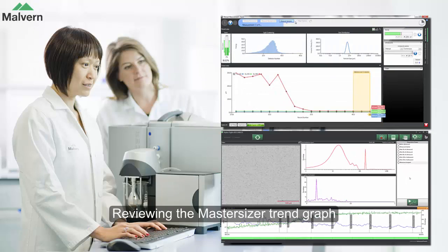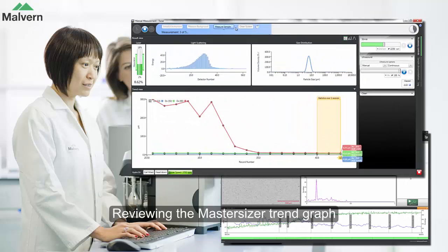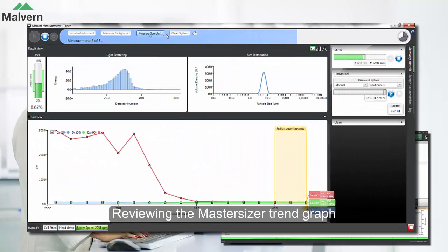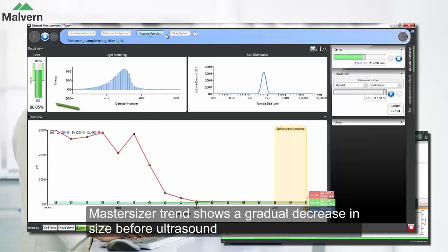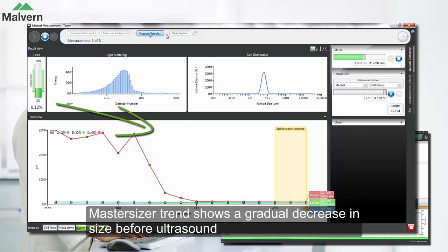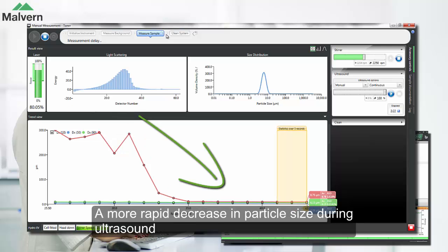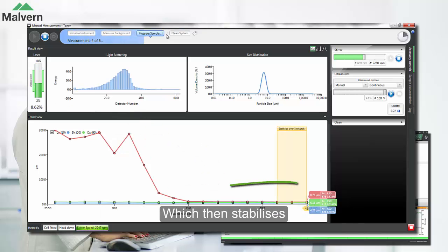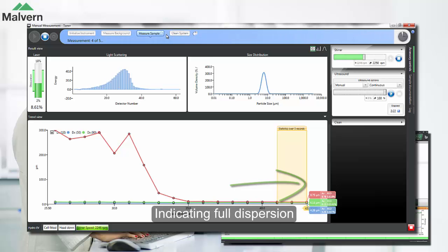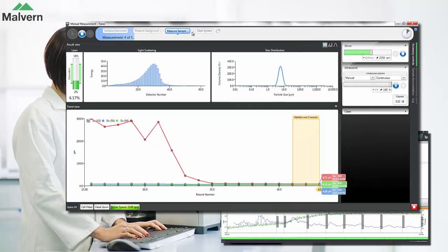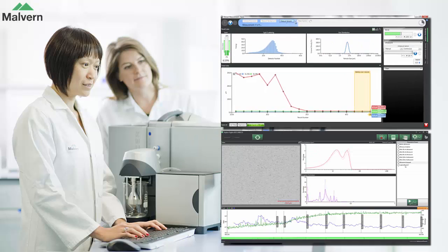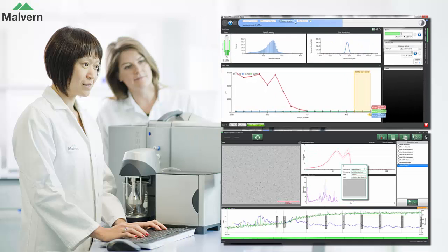If we review the dispersion trend in the MasterSizer software, we can see that there's a gradual decrease in particle size before ultrasound, a more rapid decrease in particle size during ultrasound, which then stabilizes when all the agglomerates have been dispersed. The stability of the results after ultrasound indicate that the sample is fully dispersed.